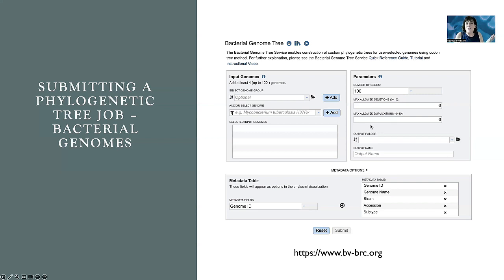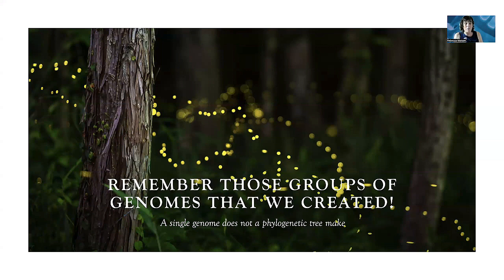Let's say you only want 20, and of the protein families that meet this criteria, let's say they have 1,000. So it'll just be some random collection of these 20 genes. But what it does when it has those things is it takes the nucleotide sequence and it also takes the protein sequence. To me, a SNP tree often is the most powerful, but this is really powerful. This is bumping up against that level, and it concatenates all those things together and builds the tree based on that.